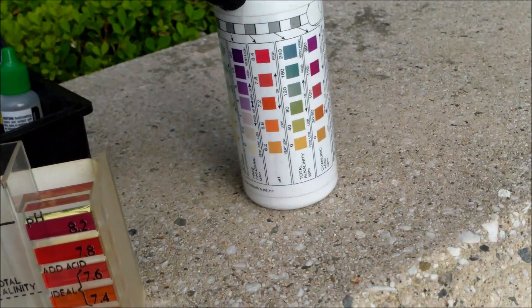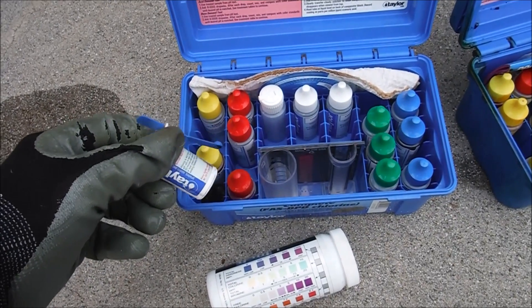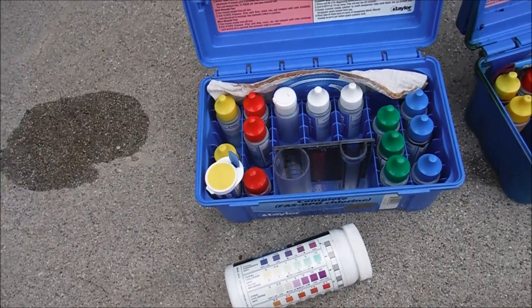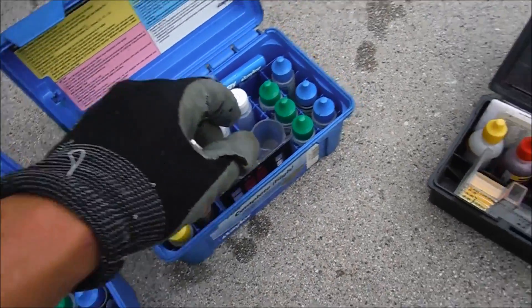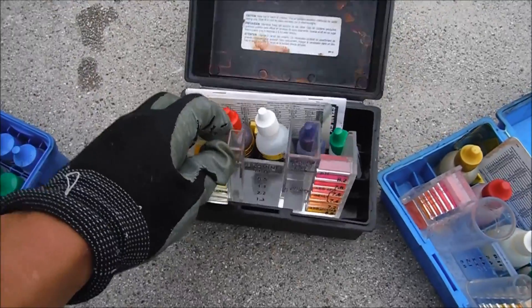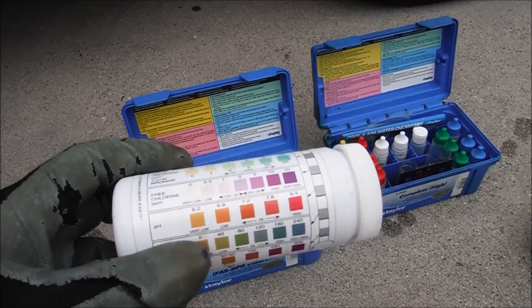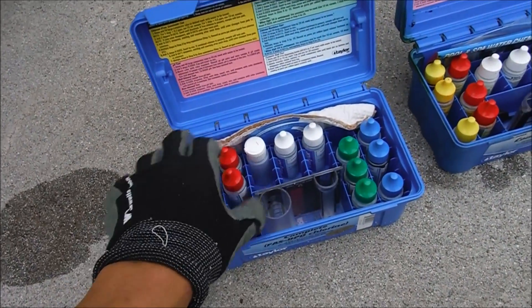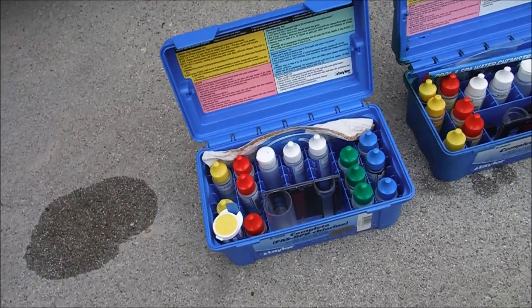The AquaStrip — you just dip it in and you can get a chlorine reading. The advantage the Taylor K2006 has is that the DPD test lets you test the chlorine reading up to 10 parts per million. The K2005 and other Taylor kits along with the 5-way test kit only go to 5 parts per million. The test strips also go up to 10 parts per million but are not nearly as accurate as a DPD test. If you have a pool with high chlorine readings, the K2006 is the only kit that will give you an accurate reading.